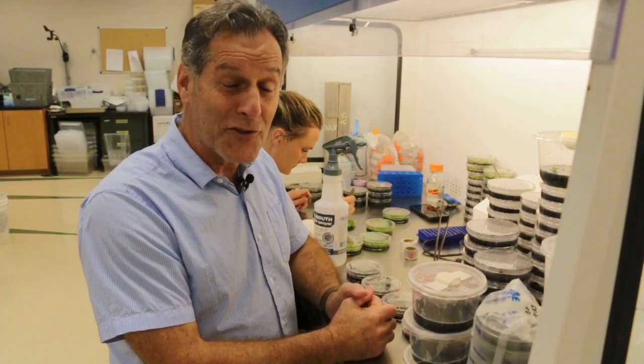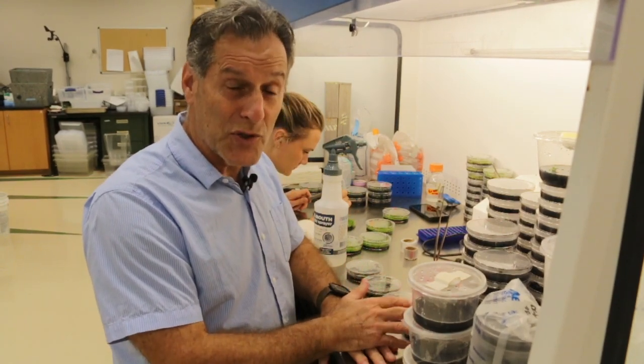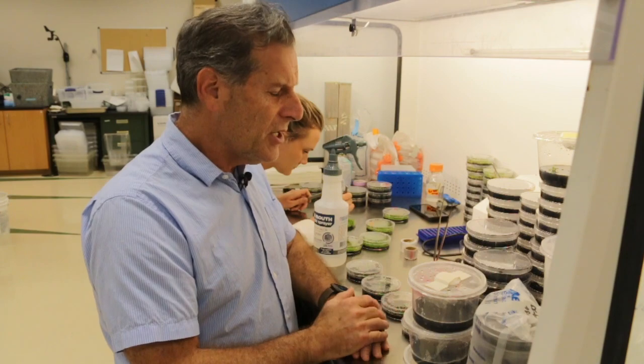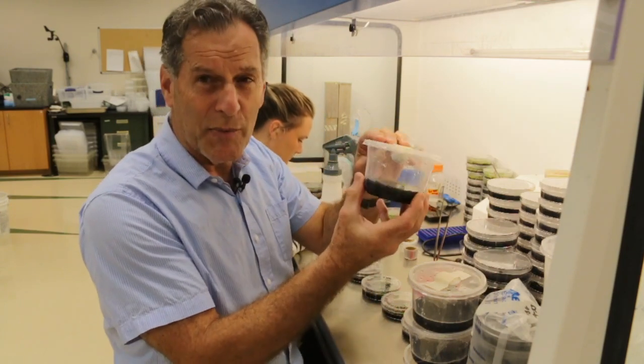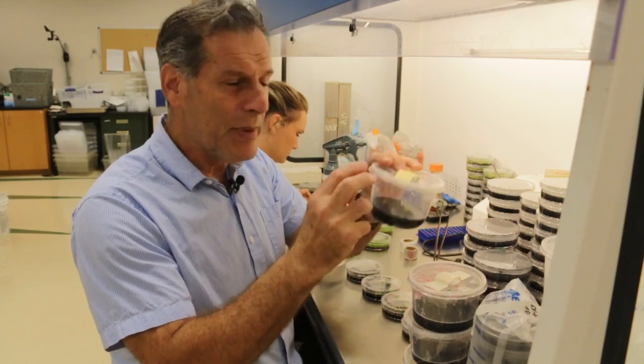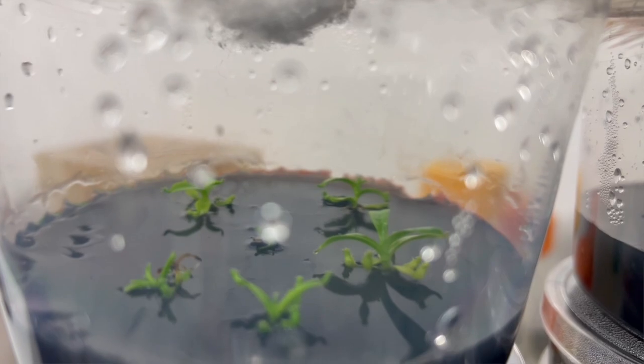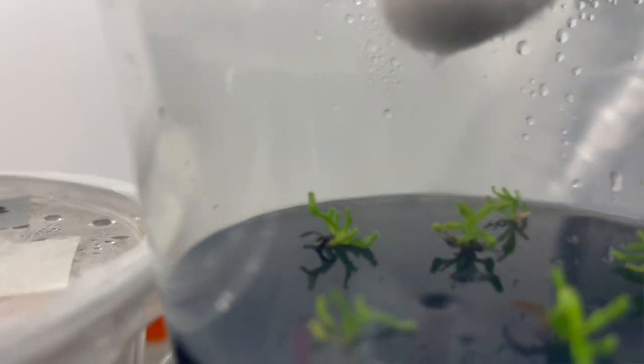All I'm going to do is transfer to the next medium. The seed germination medium for orchids is a really low salt formulation, and then I'm going to transfer to the replate medium that has a little bit higher salt concentrations and see how they go. This is Nepenthes, a tropical pitcher plant, and you can barely see the traps on these small seedlings.